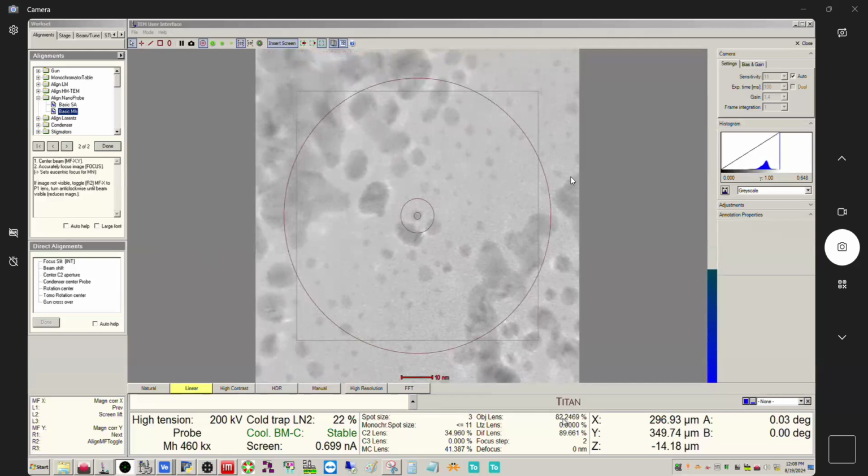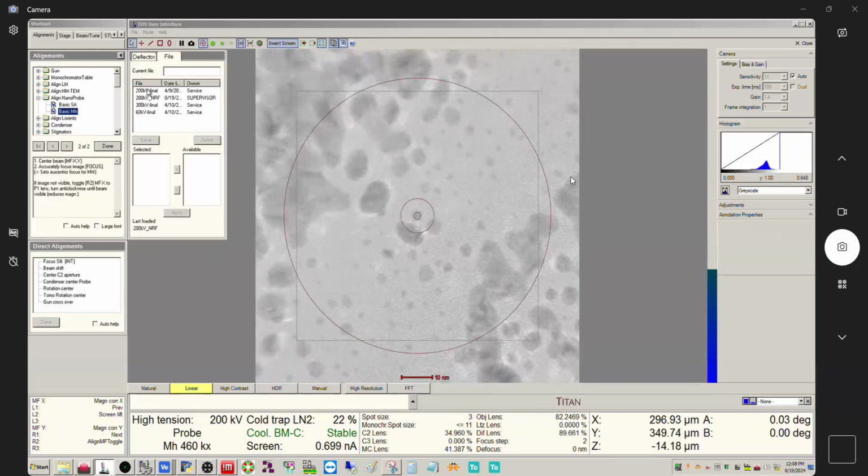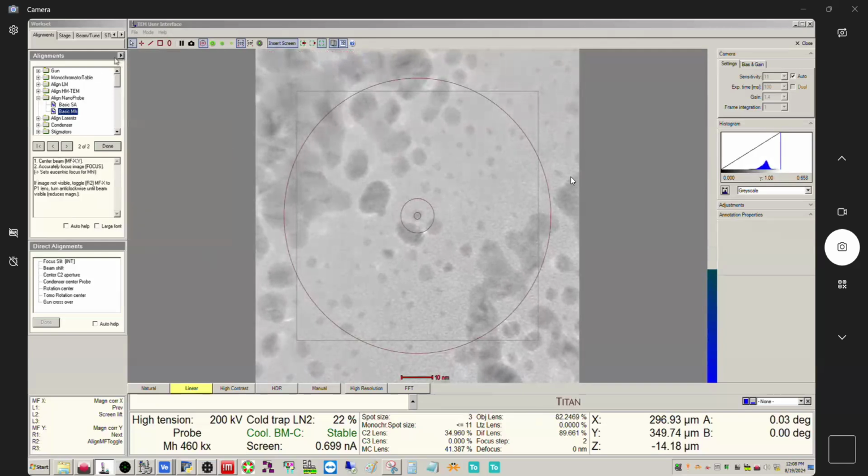Yeah, so this was, I think, 82.23 something when it was in SA mode. So, okay. All right. I think we're basically done here. And again, this is less involved than it would be if we didn't have the corrector. Okay. So we're going to click done.